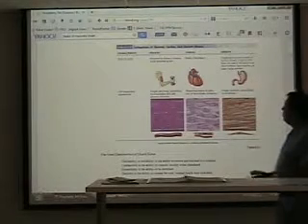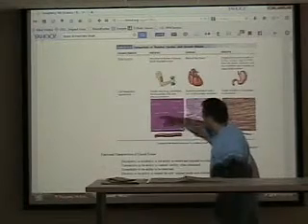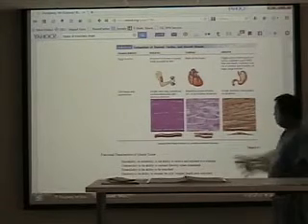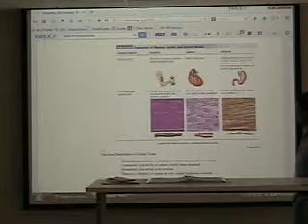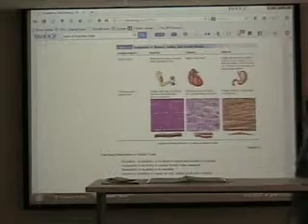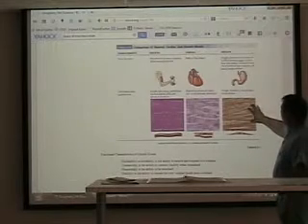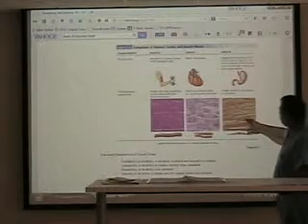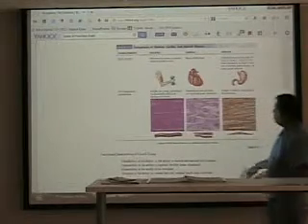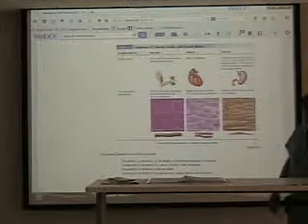Now, another term for skeletal muscle is striated. And you can see, because they got all these little stripes on them. Okay? Cardiac kind of looks like this. And again, I'll also have the pictures of your actual slides. And again, you will be responsible for identifying them. And lastly, you have smooth, because they call it smooth because you can see here on the skeletal there's a lot of striations or stripes, and here on the smooth you don't see that. Okay.